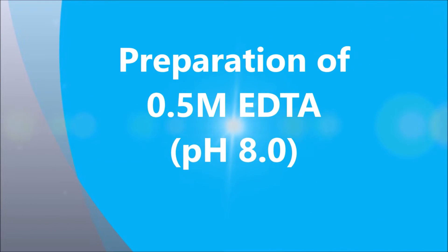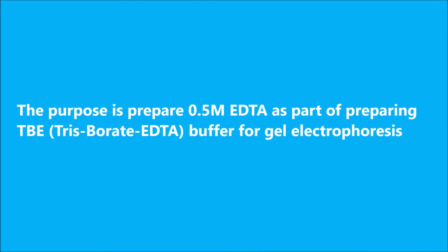Preparation of 0.5 molar EDTA. The purpose is to prepare 0.5 molar EDTA as part of preparing TBE (Tris-Borate EDTA) buffer for gel electrophoresis.